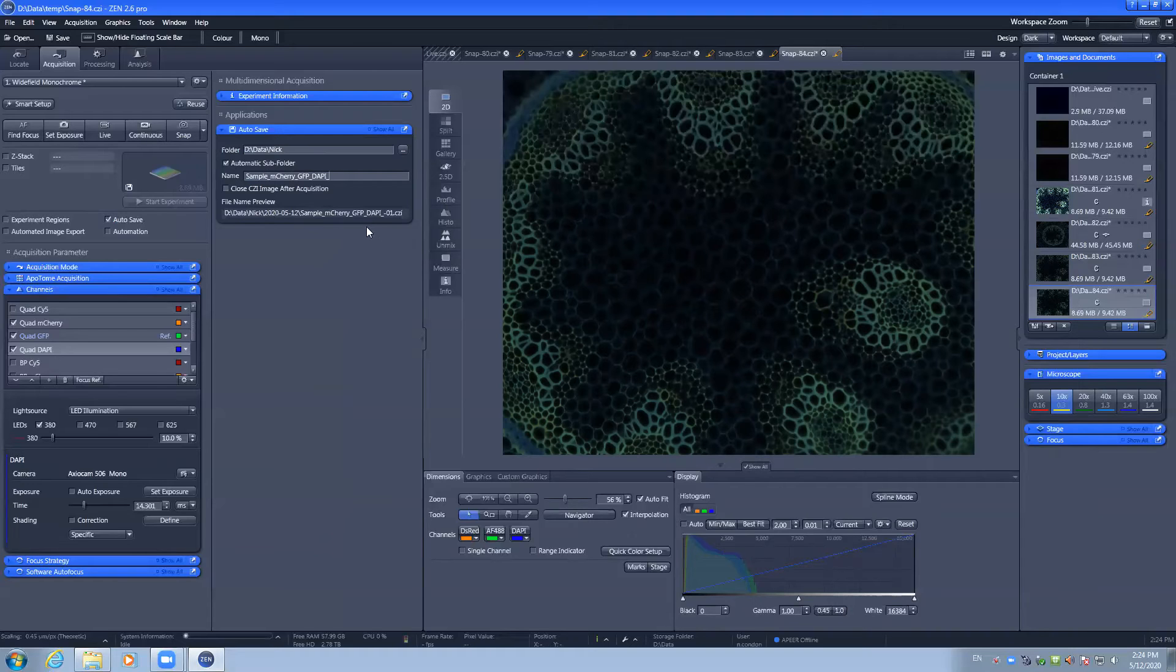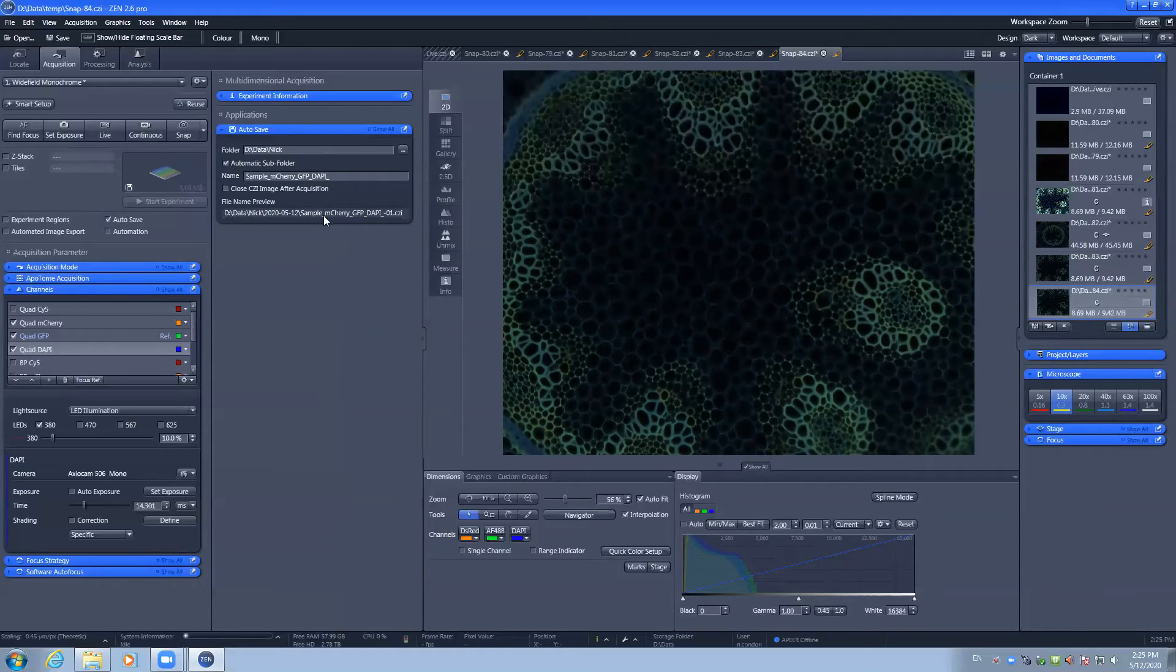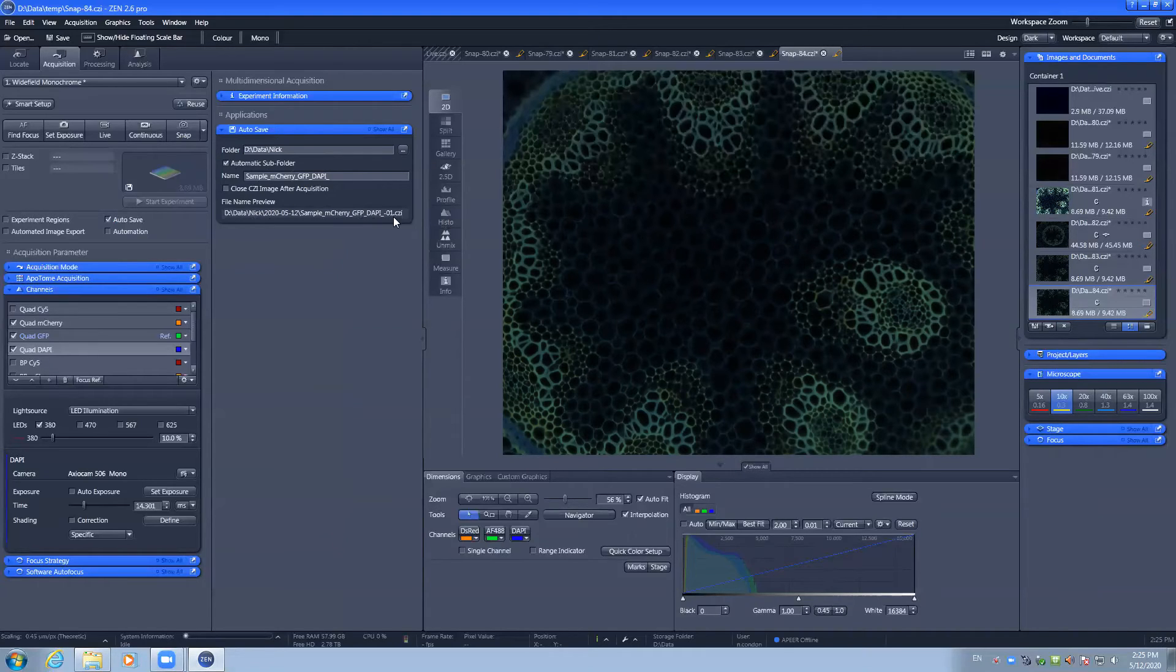The file name preview shows you the path, as well as the file name, including a number that is incremented automatically for each capture.